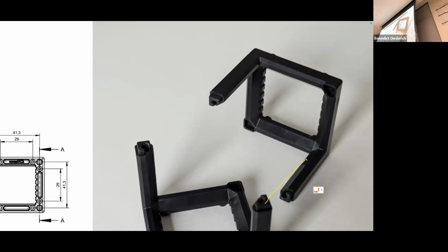Well, the period between 2 cycles, one cycle, is 650 nanometers. So when you move this wave by 650 divided by 2, then you already have black. So it's canceling each other out.